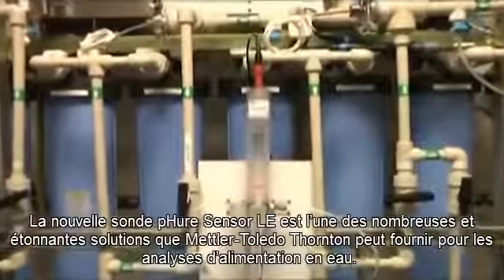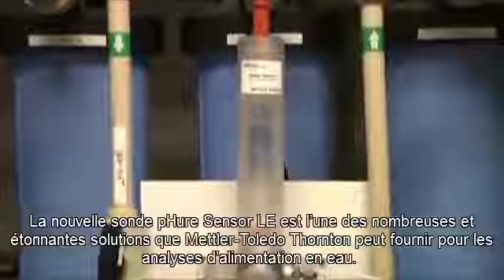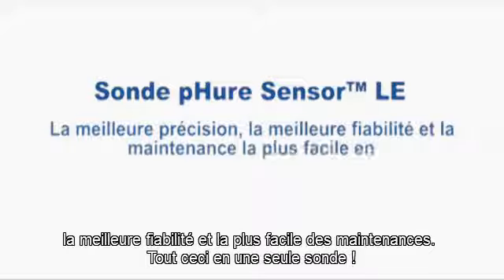The new PureSensor LE is just one of many amazing solutions Mettler Toledo Thornton can provide for power water analytics. It solves the challenge of measuring pH in very low-conductivity water with the best accuracy, the best reliability, and the easiest maintenance available in one sensor.